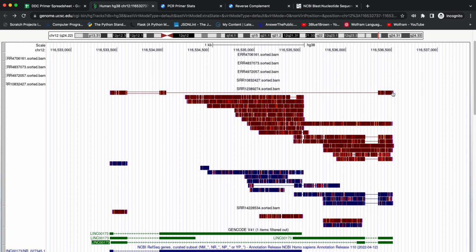But here, all the way at the back, maybe the sequence or the insert we can roughly approximate as 200 base pairs. Eventually, we're going to calculate this, but for now, you should try and design inserts that roughly exist between 200 to 1,000 base pairs. Those will be the easiest to amplify with PCR. Generally, the shorter the sequence, the easier it is to amplify.